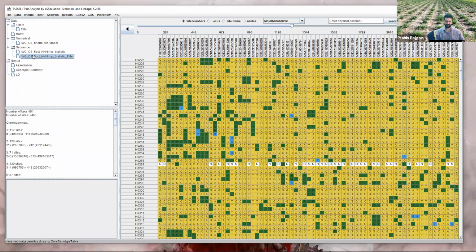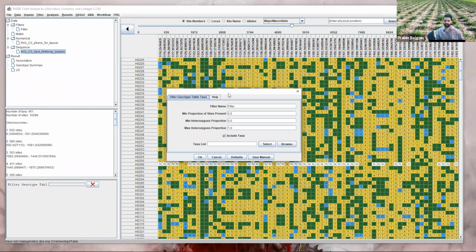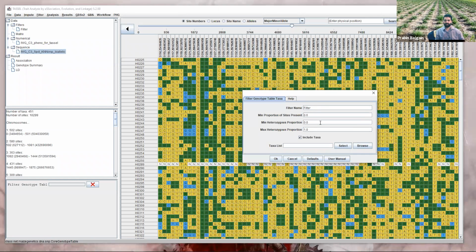You could do that if you had a not outcrossing crop. So I'm going to delete this. Then you go to filter. Now we're going to filter the entries. Without taking count, I don't know how much 289 has, so we'll just keep as each entry has to have at least 60% of all the loci present. And maybe this has 50%. That's why it's being thrown out.